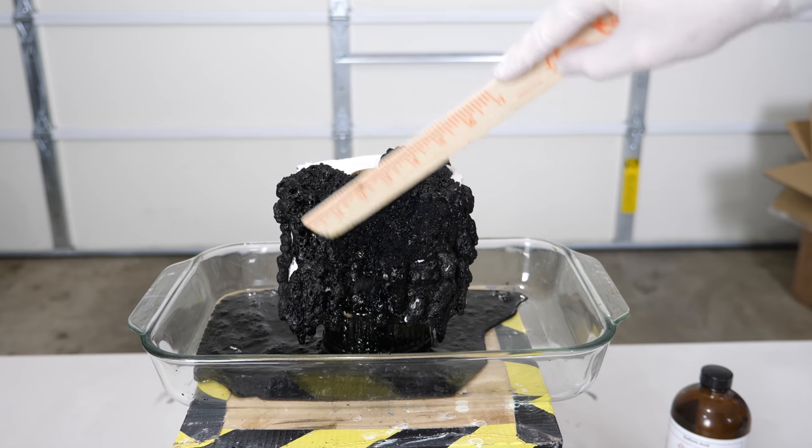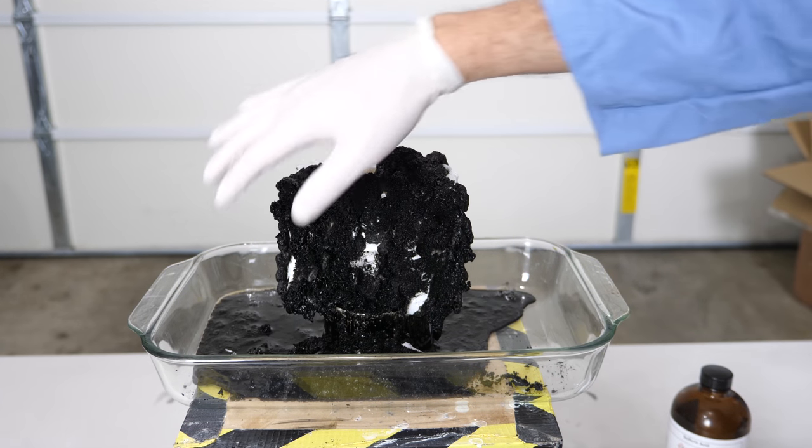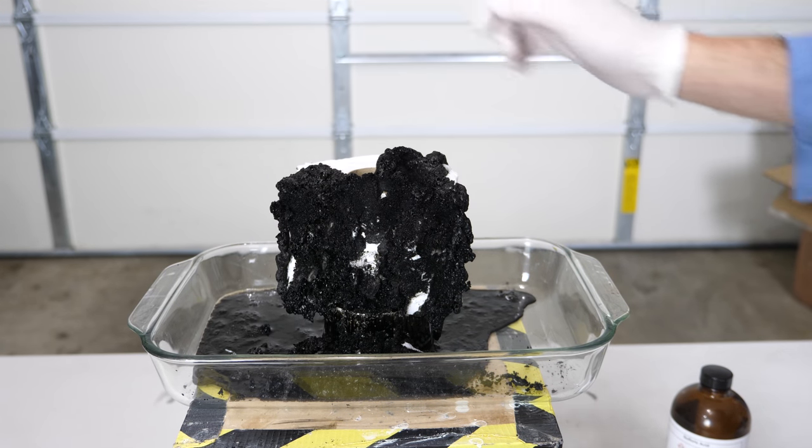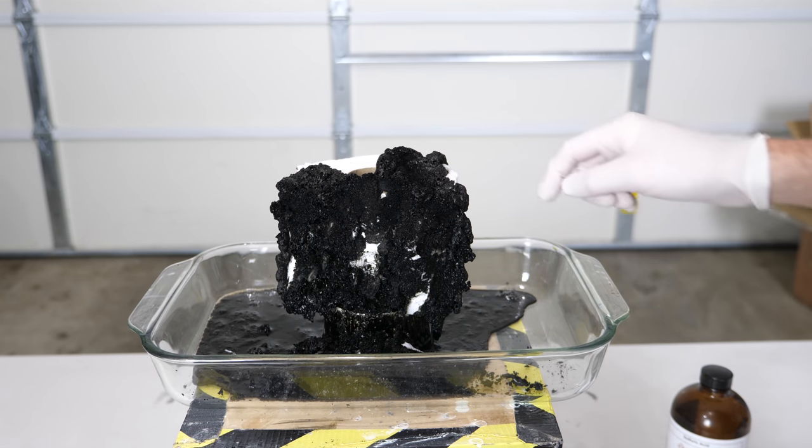Whoa! It's going to burn now. Whoa, you can just feel the heat coming off of this. This is boiling hot water — boiling hot sulfuric acid water sludge.